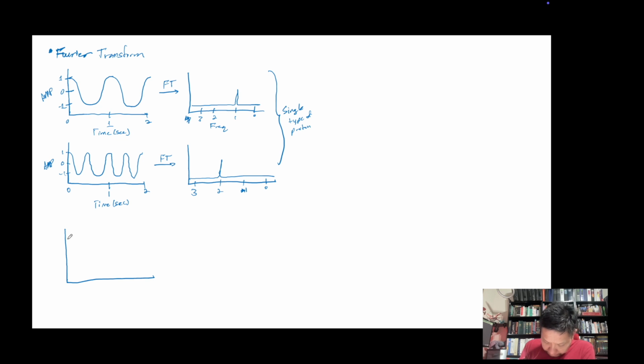Well, again, we'll draw out our little thing here where 0 is here, 1, -1, and this is amp. And so we'll draw 1 proton. I forgot to draw the x-axis. Sorry, we need to do that too. 1, 2, there we go. And so let's do 1 proton as a 1 hertz proton. And then let's do another proton that's a 2 hertz proton, which precesses at a rate of 2 cycles per second.